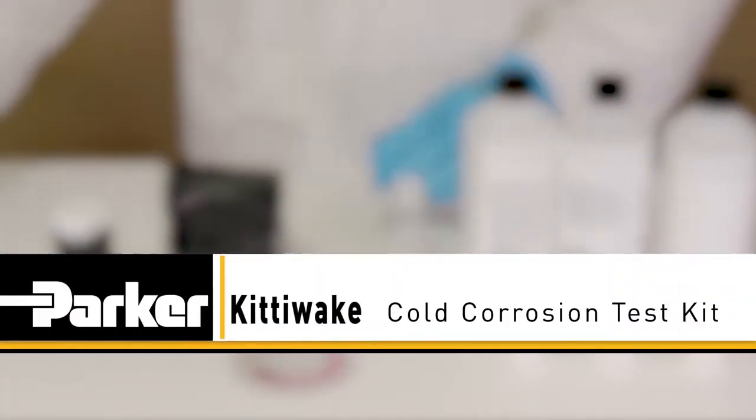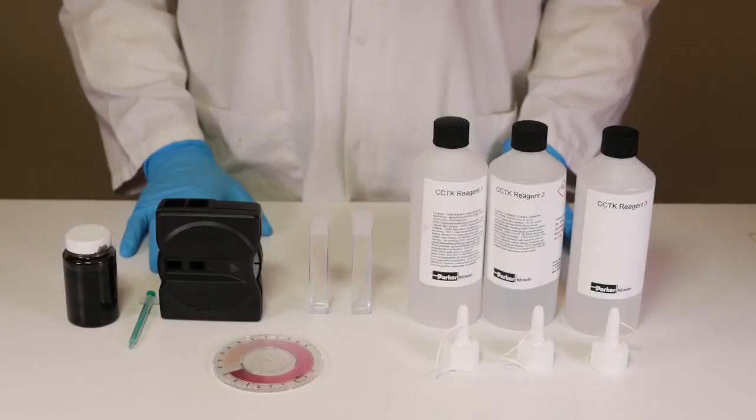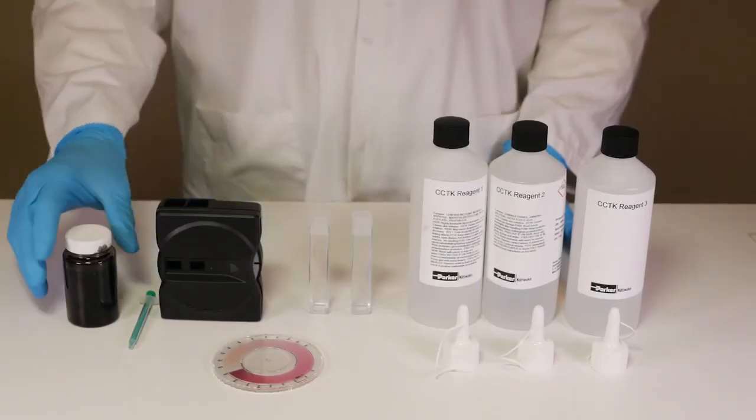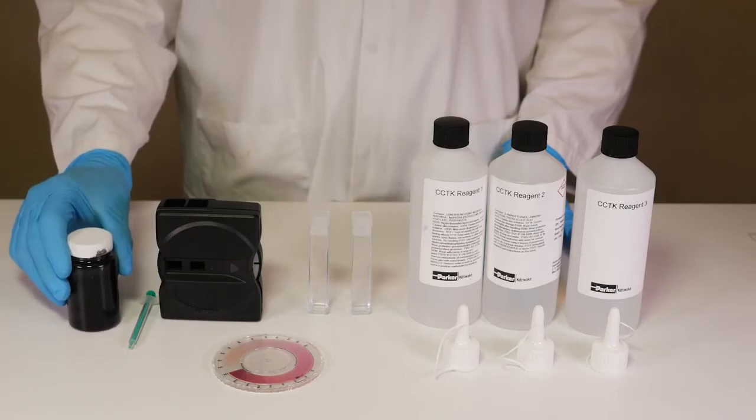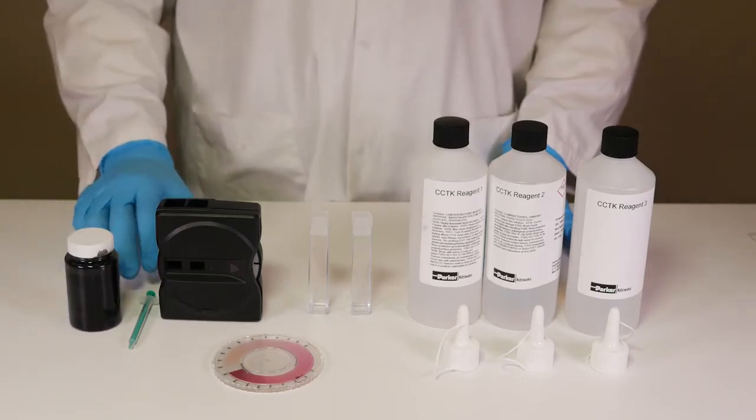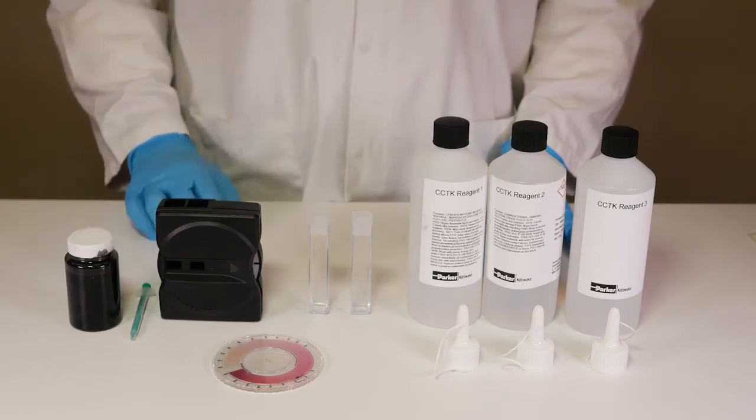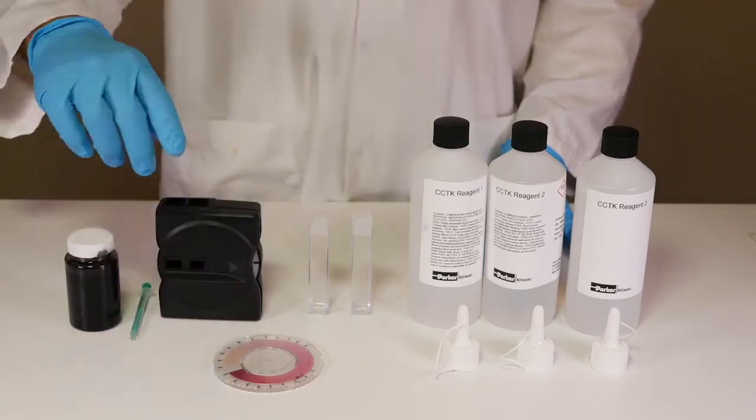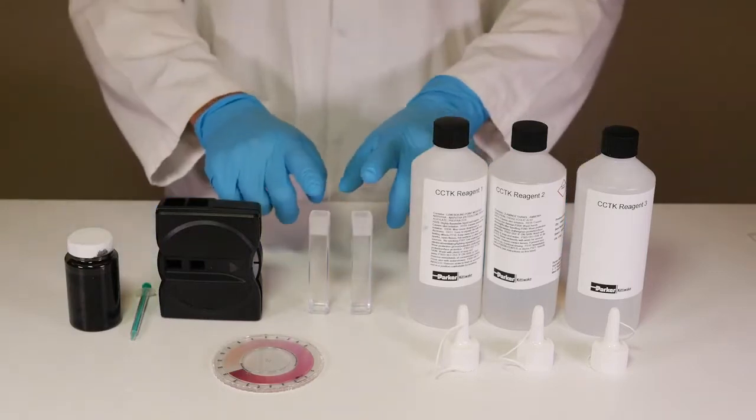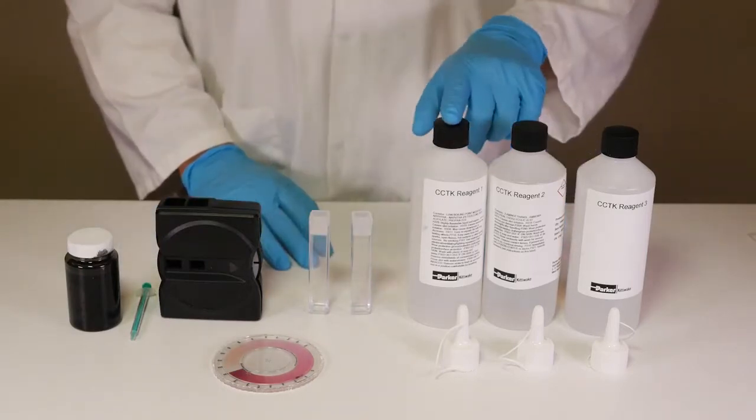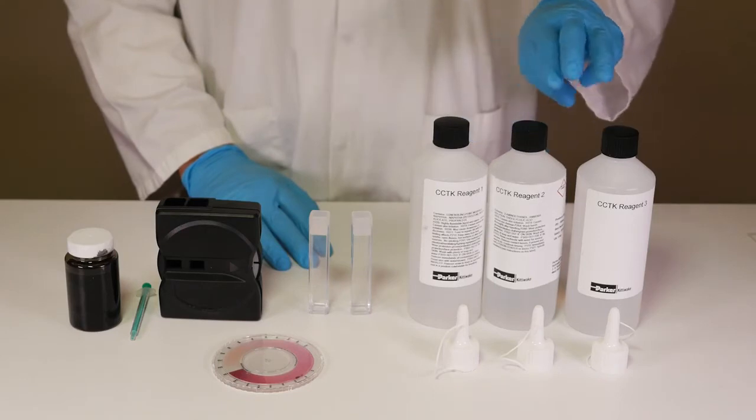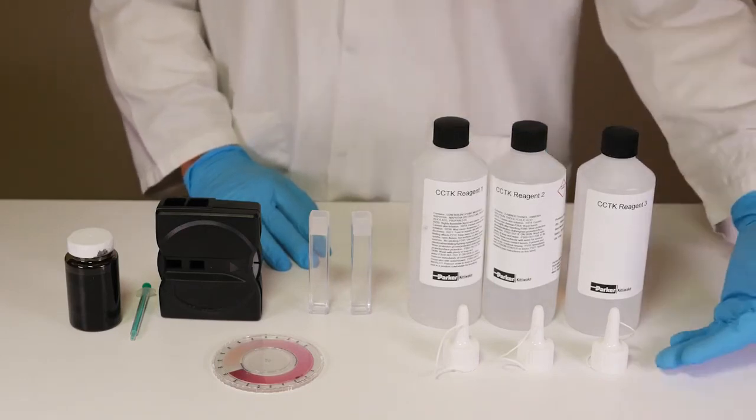To perform a Parker Kittiway cold corrosion test you will require the following: a sample of your cylinder scraped down oil, a one milliliter syringe, a comparator and colour wheel, two cuvettes, reagents one, two and three, and a pouring lid for each.